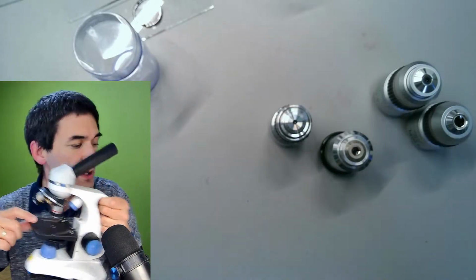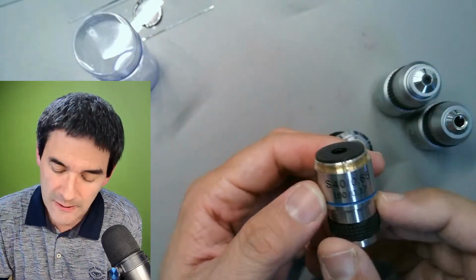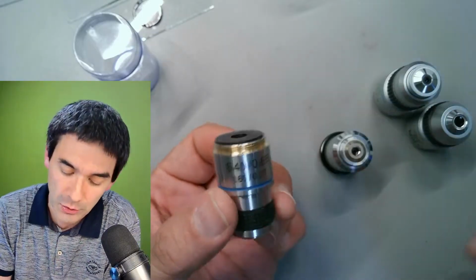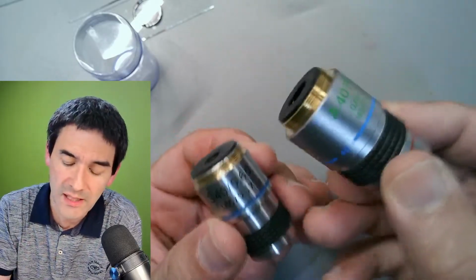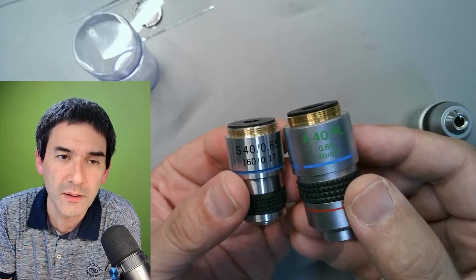So this is simply something that I want to inform you about, because I do occasionally get questions, and then I say, yeah, you can exchange objectives if you just make sure that it's also 160. But I'm saying, well, maybe not always, because not all 160 millimeter objectives have the same so-called conjugate distance, right? So this is a little bit of an issue.